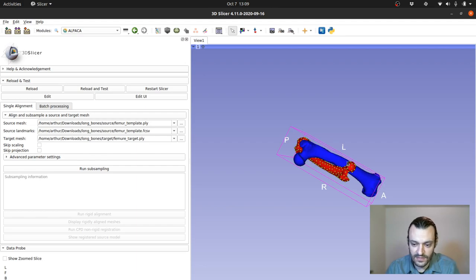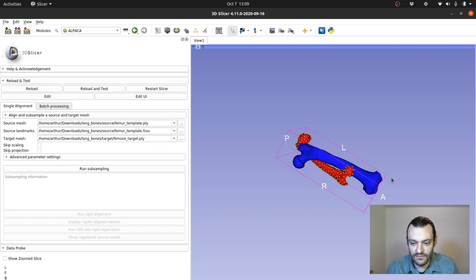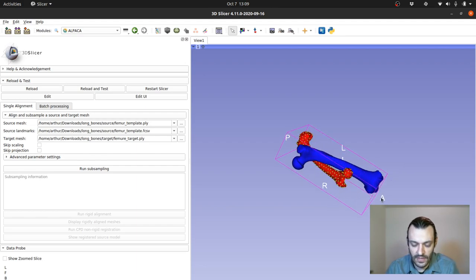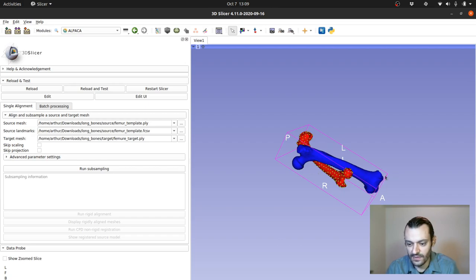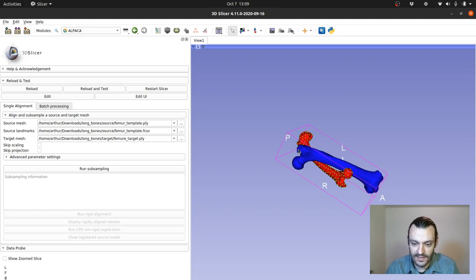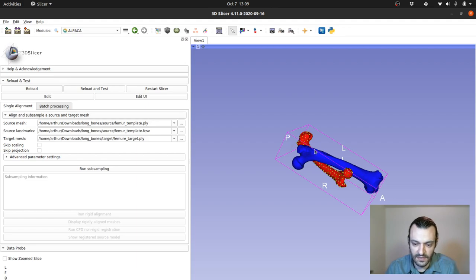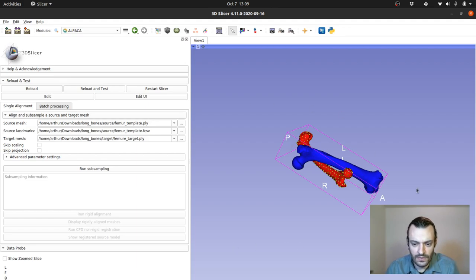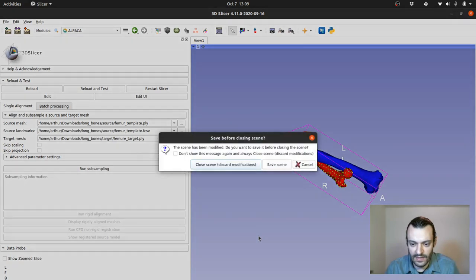So ALPACA is going to try to align these two structures and deform the female mesh so that it matches as perfectly as possible the male one. And then eventually transfer the landmarks so that in the end we end up with collecting the same landmarks that we collected in the female mesh in the male mesh. So let me just clear this scene so we can walk through the ALPACA pipeline.